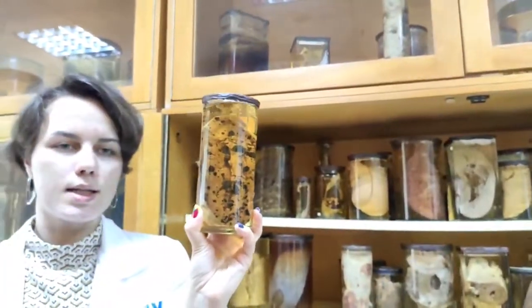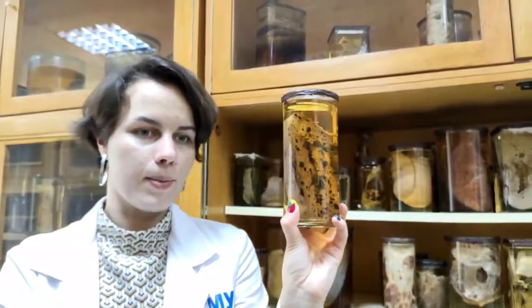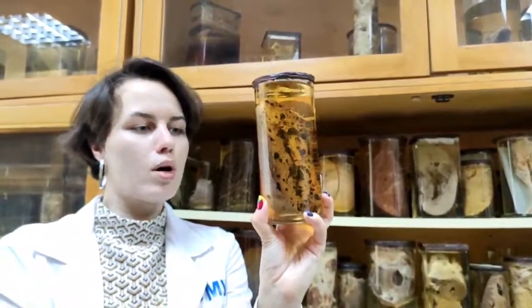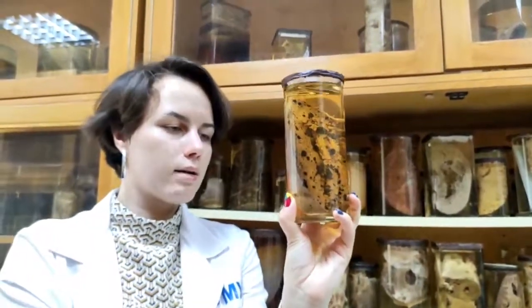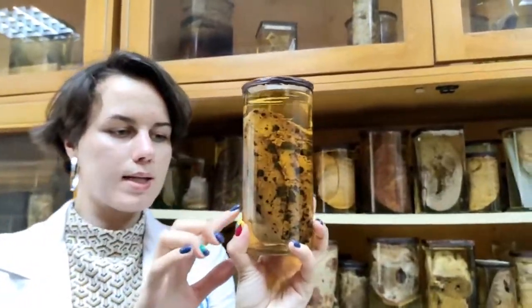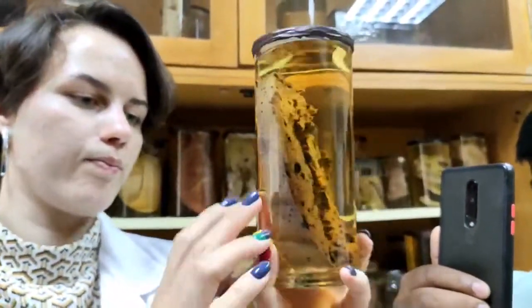Do you know what melanocytes do normally? They make melanin, and that is why we have different shades of our skin. Those people who have more melanin have darker skin. So in this tumor, melanin is also produced, and we can see that these spots with metastasis have black color.